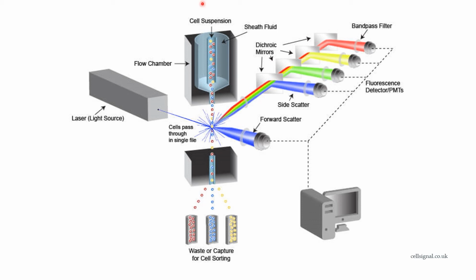Once your sample is prepared, you put your tubes in the machine. The machine will drop your sample super fast as a thin flow, very thin, like one cell at a time, theoretically. The machine then will fire a beam of light towards the cells. Depending on the properties of the cells, the light will scatter in different manners. The machine then has different detectors to capture those scattering patterns. And then the machine will sort out the signals of different probes and count them. And of course, the machine will feed all those signals into data points on a computer. So for example, if the forward scatter pattern has higher magnitude, the machine interprets it as your cells are bigger, things like that. So in the end, you're going to get quite a detailed profile of your cell sample population.